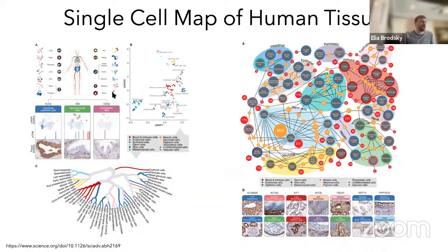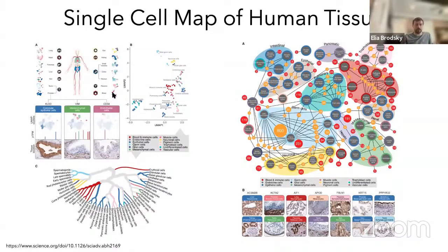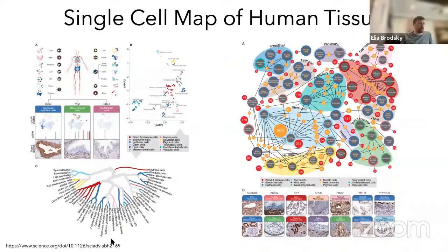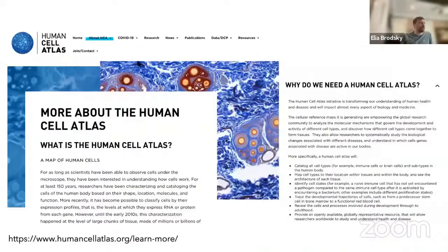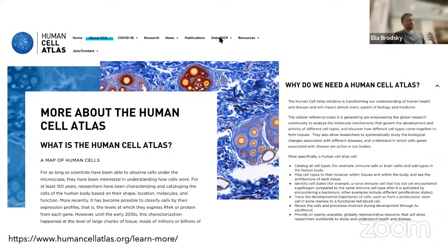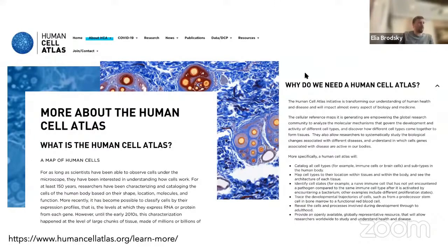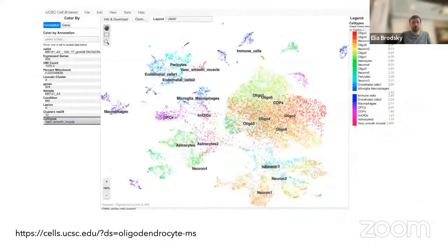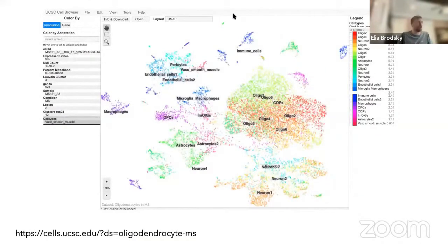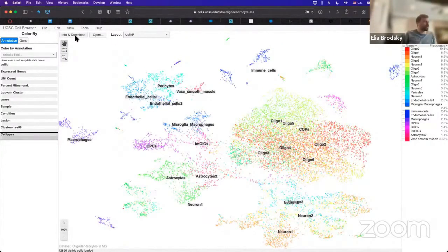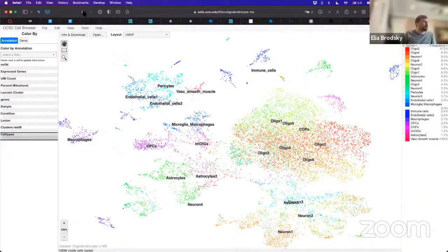They took both imaging, bulk RNA-seq, and single cell data to try to dissect all these tissues into individual types of cells that we could reference and understand specific genes that are elevated or down-regulated. Let's actually take a look at this. This is the place that you would go to find the actual data, and you can read here a lot of the sources of the data that they used.